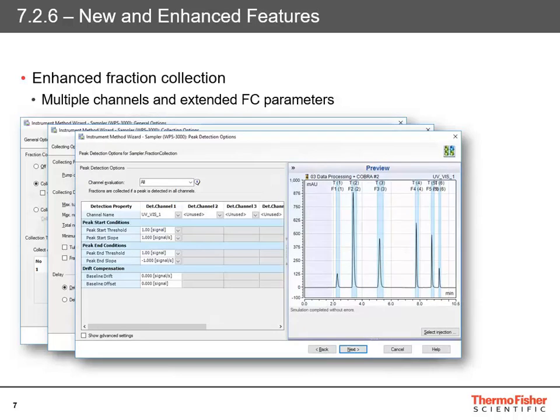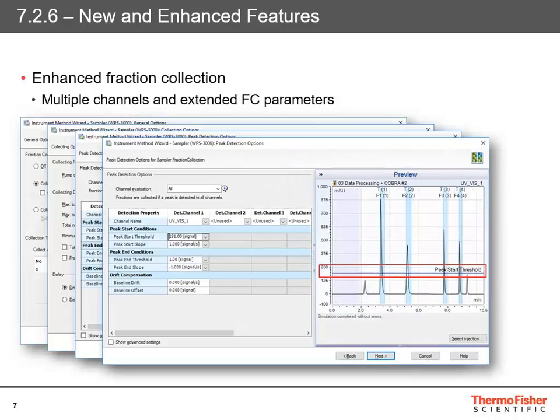Then we get into the actual setting of the parameters. The initial view on the left-hand side shows the key main conditions to set up basic fraction collection. As you change those — for example, if you change the peak start threshold to a much higher level — you can see on the right-hand side a bar showing where the peak start threshold is, and you can see the first and last peaks are no longer collected, with the actual collected portion updated on the other peaks too.